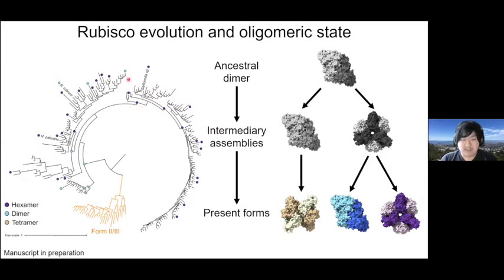And you see the right-hand side of this entire tree is entirely hexameric according to our sampling. And so it seems that the hexamer was the predominant form here. But we are interested in the left branch here because you see that there is this interconversion event where this maintains a dimeric ancestral state up until a hexameric state. And from there, these will be characterizing in the future as well, just to fill out this tree more. But we do see that you actually do get loss of the hexamerization.